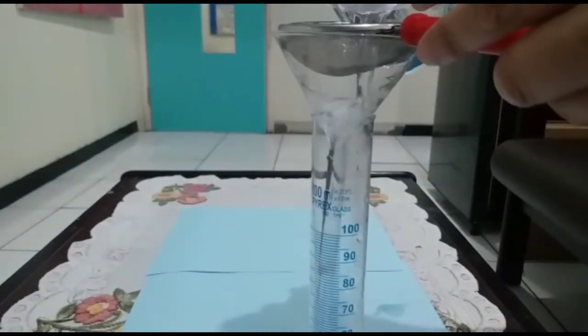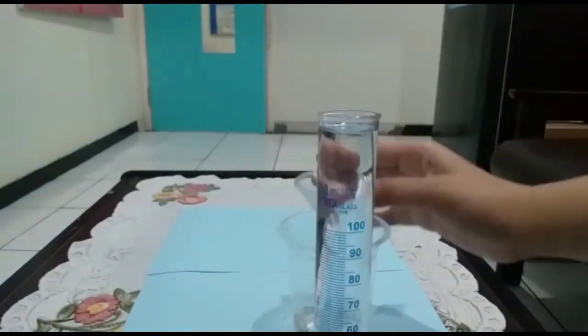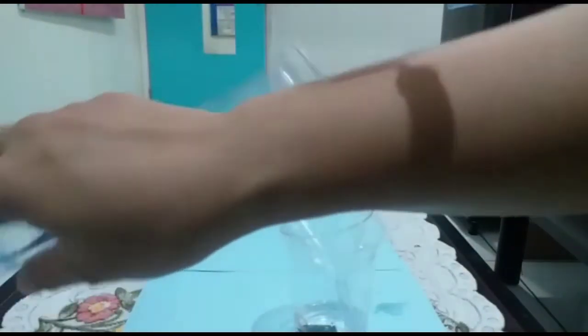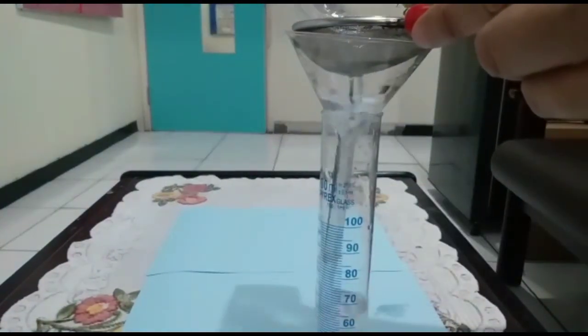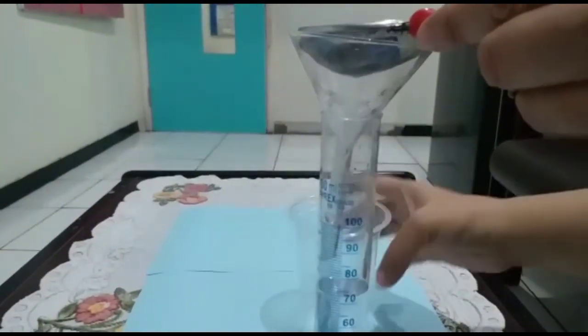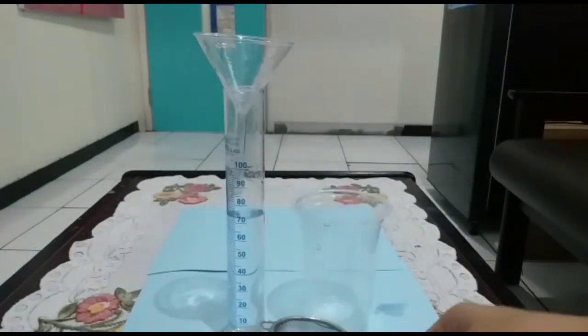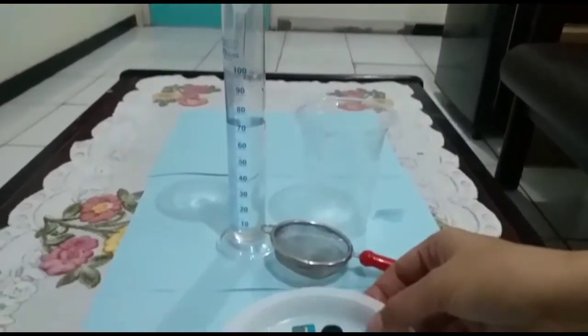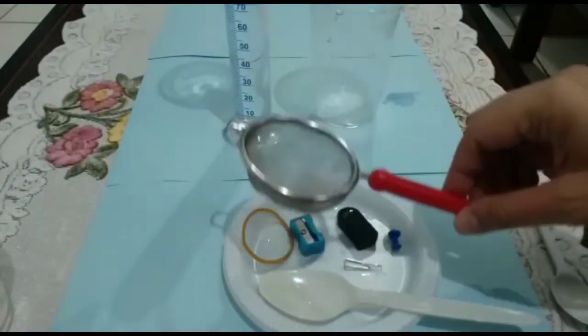Place the sieve on the funnel. Pour the mixture. As you can see, all the insoluble material is left on the sieve, and it's separated now.